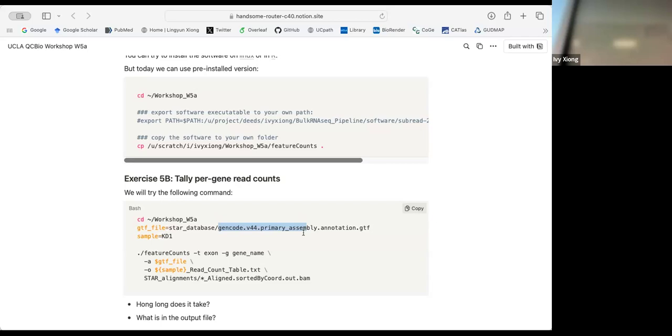Right, so I would recommend you try on the mouse and everything, because that's actually the goal. Okay. And then you can compare for all of the mouse data. Okay, hopefully it's good. Is that part 6? Yeah, that's exercise 6. Okay, so good, I just bring it. It's a big one.